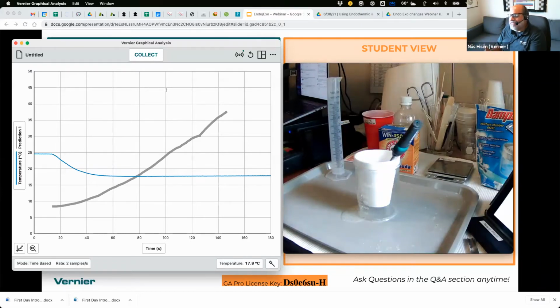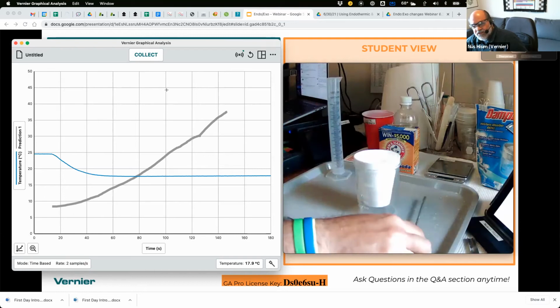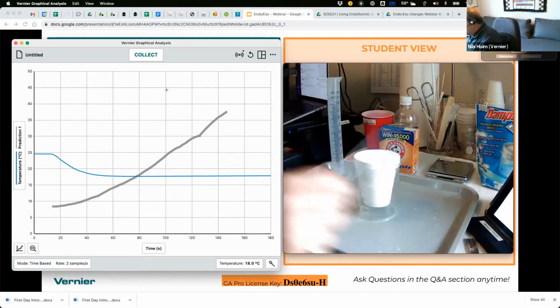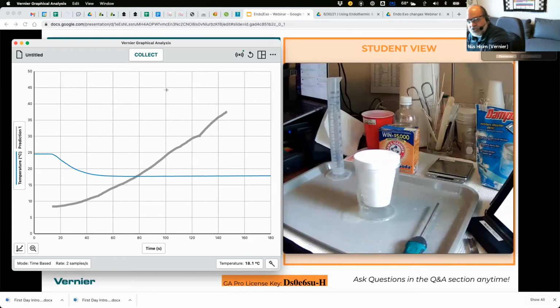I kind of like the idea of just using the defaults on day one and just getting some data and having kids get excited about that. And it's not changing anymore. What's going on, and so, I'll get that out of the cup just so that I can give it a chance to warm up a little bit. And then they do a little analysis. Now, the analysis part, you have to do yourself.